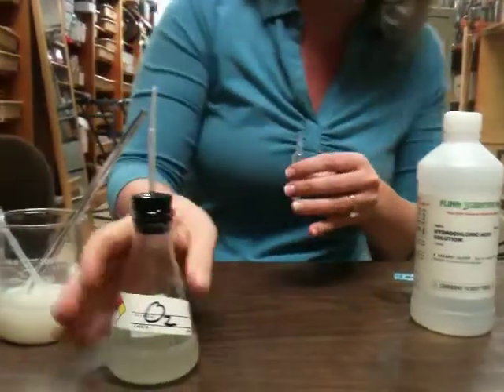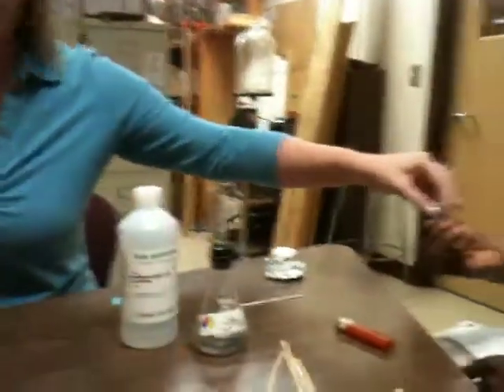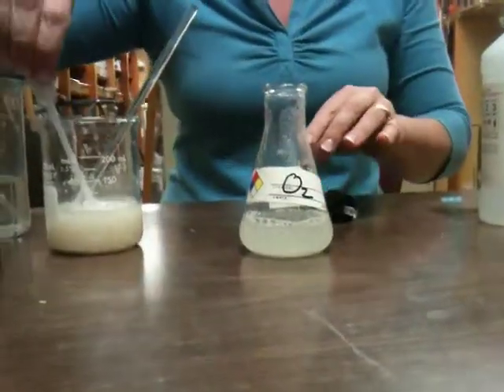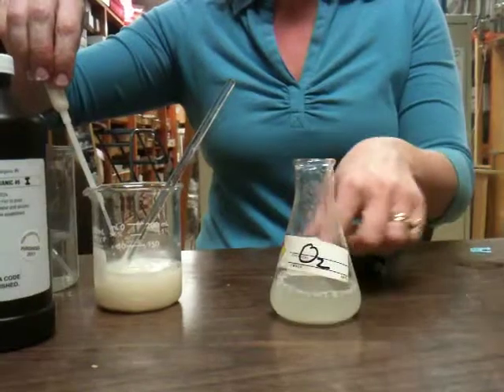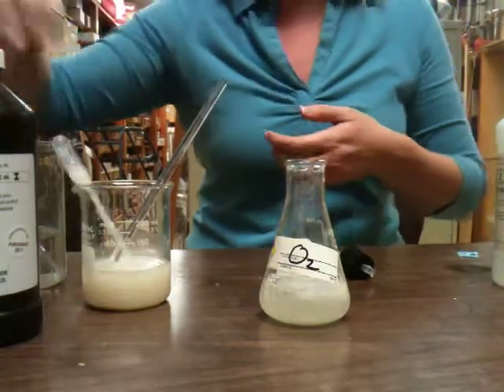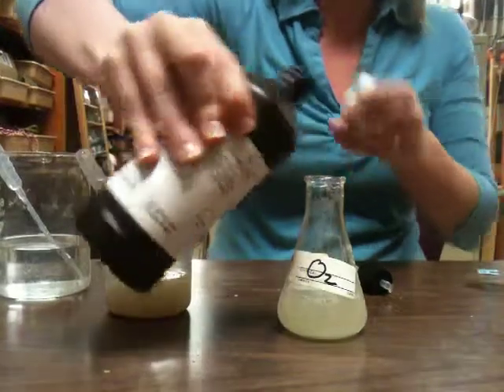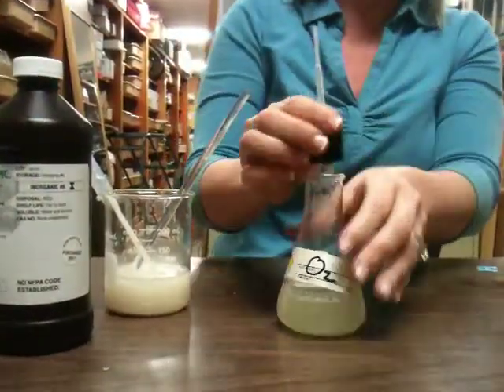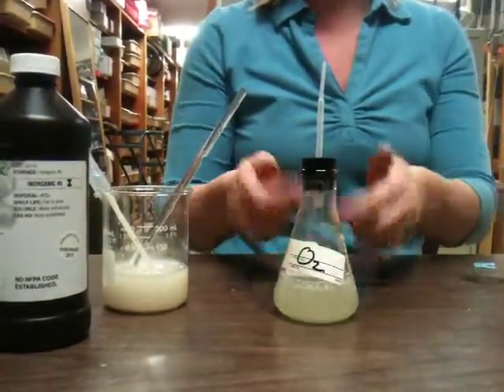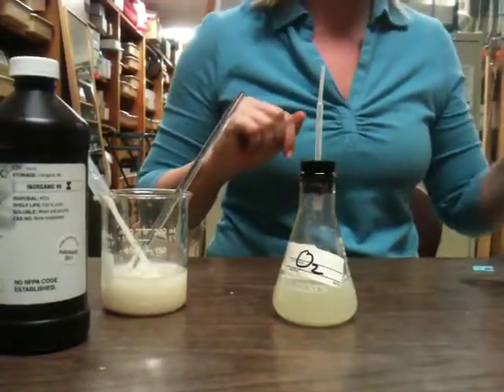And then this one's already going, but I'm going to add a little bit more so you can see how it works. Alright, so you would take off your stopper. If it already looks kind of milky yellow, you don't really have to add that much more catalyst, so I'm just going to add a little bit like that. You can add more peroxide. And then you want to get your stopper on. You want to wait about a minute because in that amount of time your flask will fill up with oxygen gas. And by that time, the only thing that will be coming out of the top will be oxygen, and you'll collect that in your bulb.